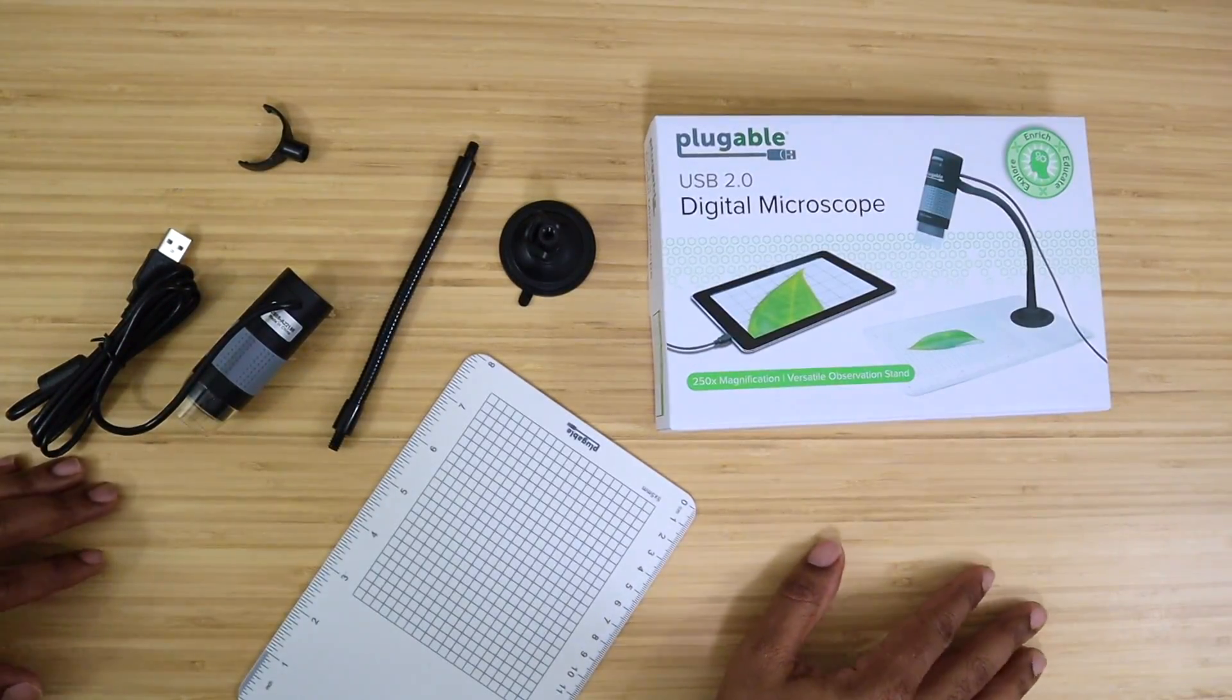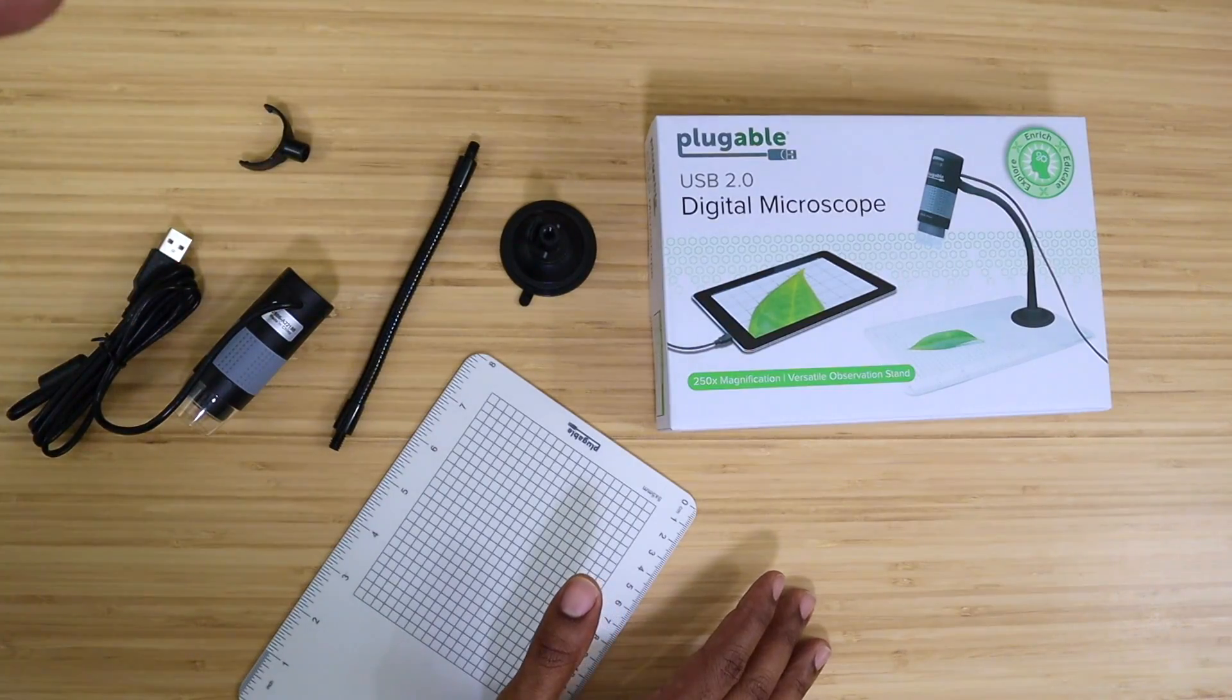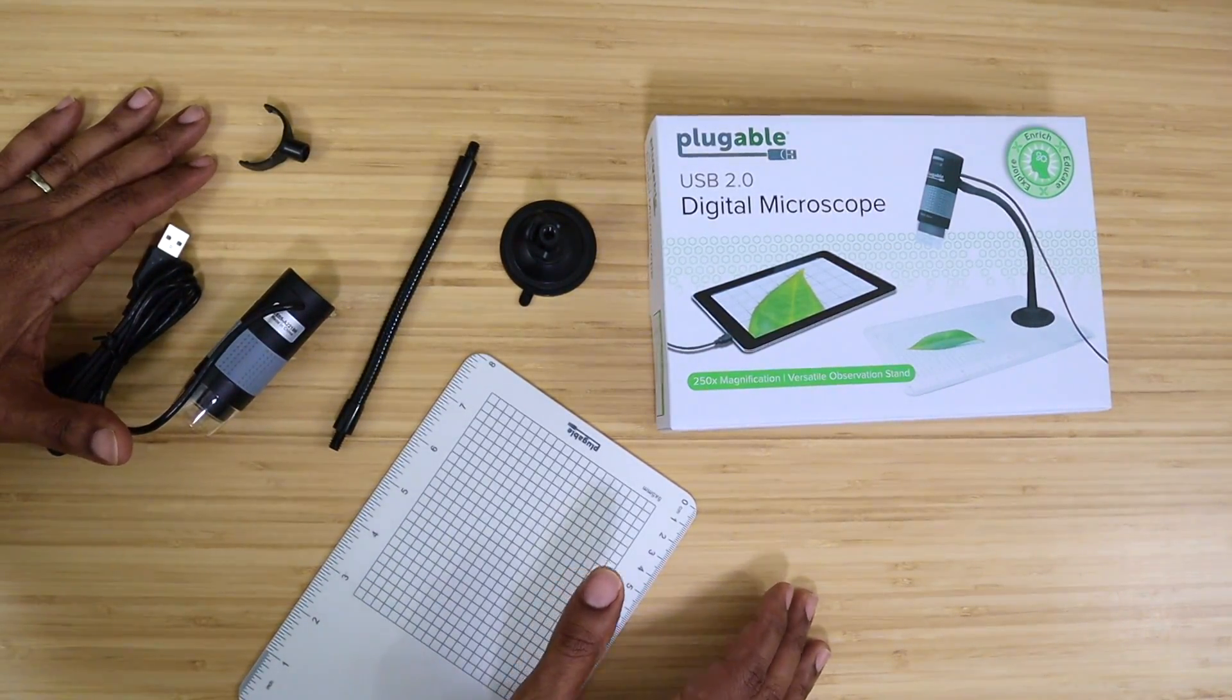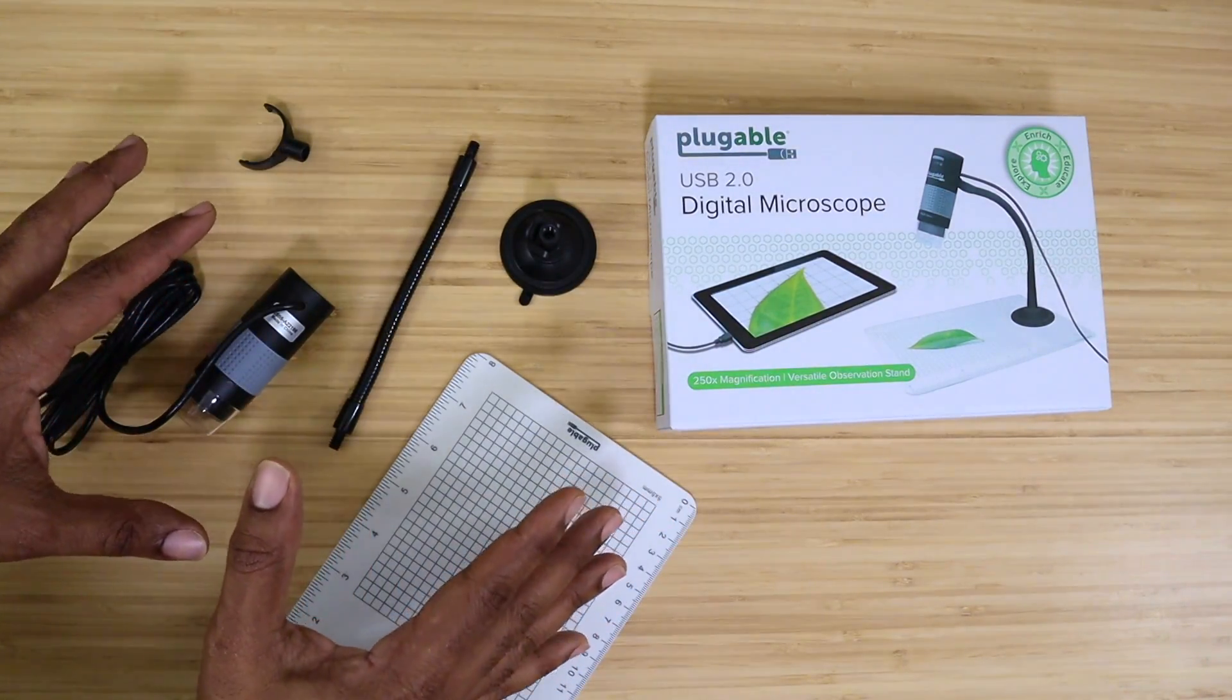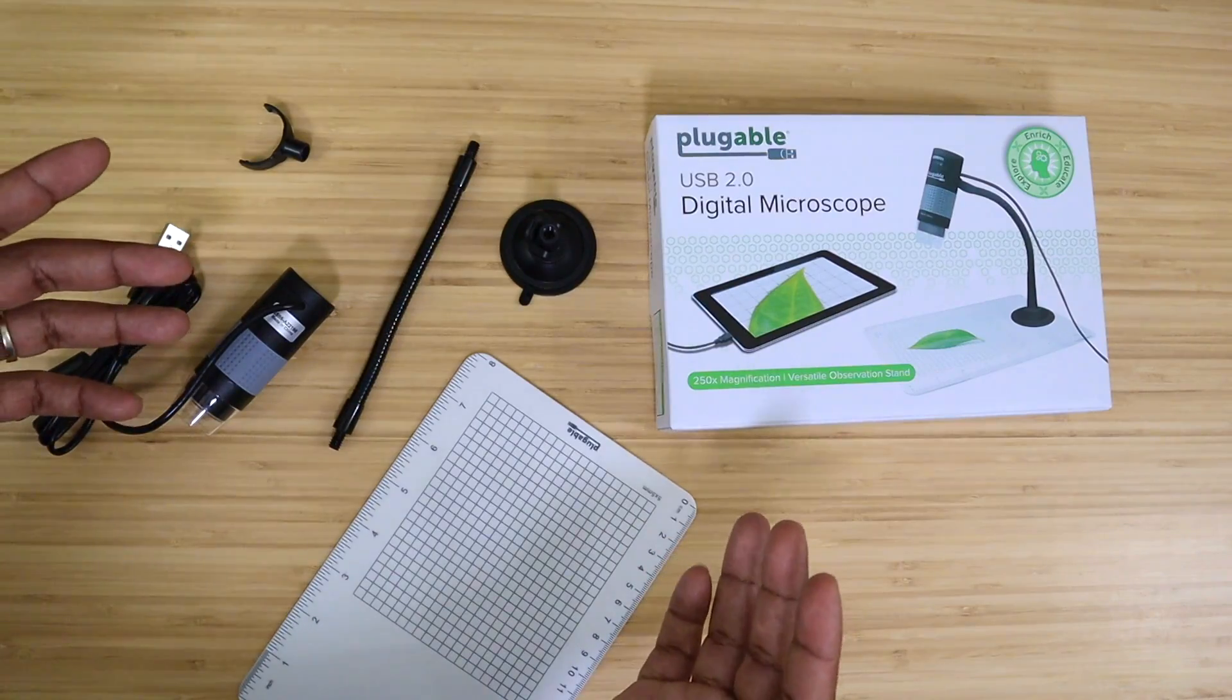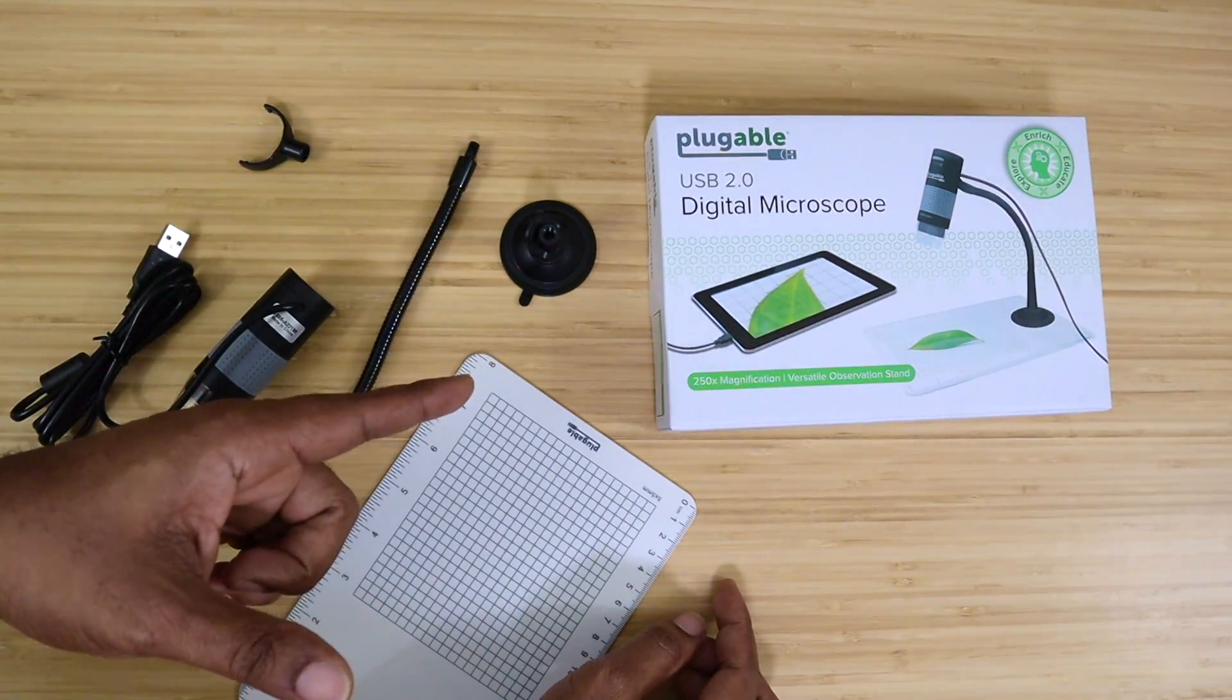What's up guys, Average Tech Guy here. Today we are back with more tech, more reviews, and this time we are going to be looking at a USB 2.0 digital microscope by the company Pluggable. Now because everybody's going back to school basically at home, kids are going to have to have a new way to explore science.